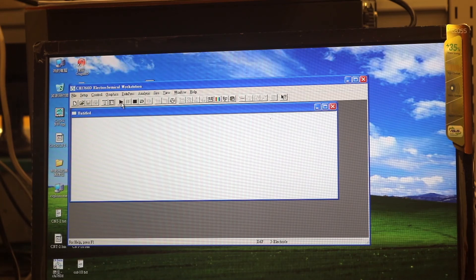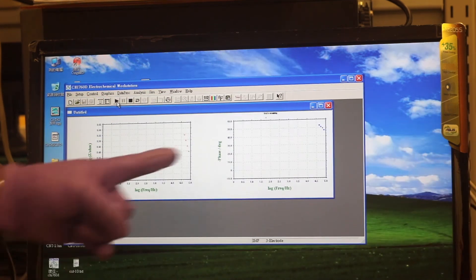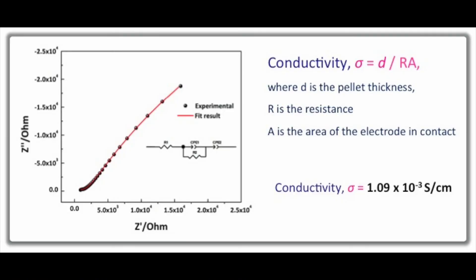You can start collecting the data. Here is the data. This is the final impedance spectra. Conductivity is sigma equal to d divided by r times a, where d is the thickness of the pellet, r is the resistance, and a is the area of the electrode. The final conductivity of the pellet is 1.09 × 10⁻³ siemens per centimeter.